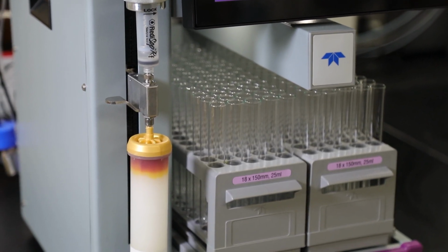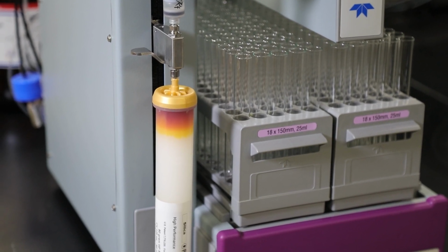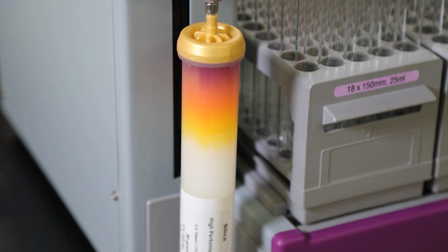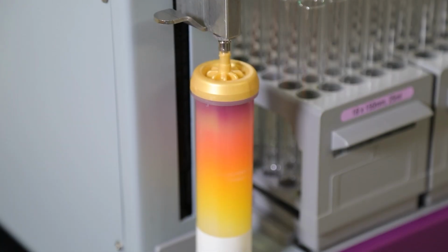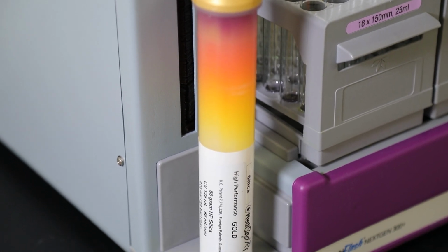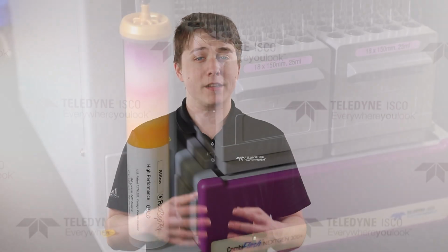The bands of color you see are the various components of the dye. Not all components may be viewable to the naked eye. As the concentration of ethyl acetate or the strong solvent increases, it causes the other bands to start moving down the column. Once the compounds in the test sample elute, or separate out, through the stationary phase, the individual compounds are ready to flow to the detector.